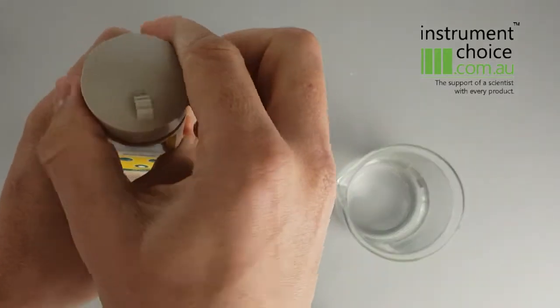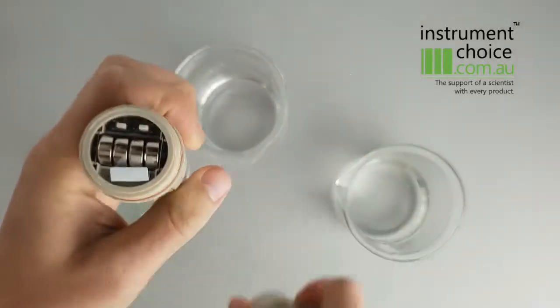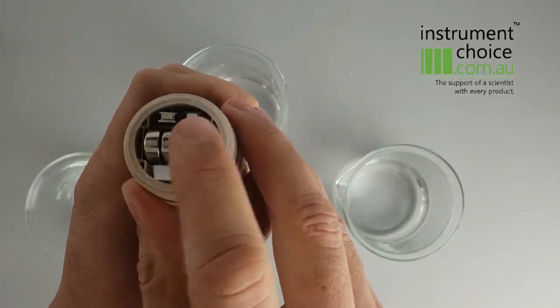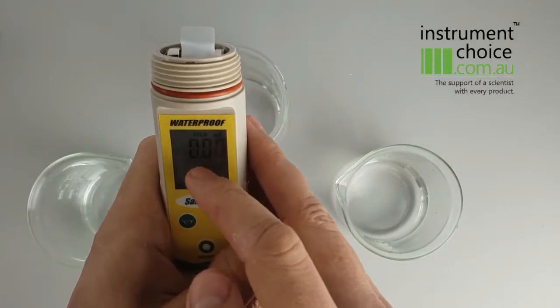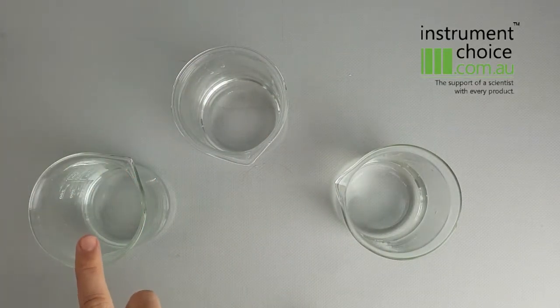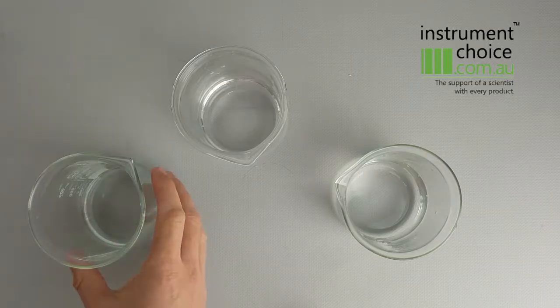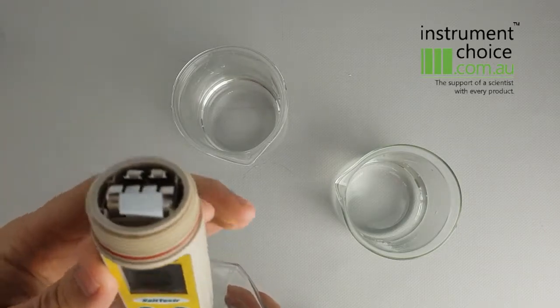You remove the top cap and underneath there's an increase and a decrease button, so either of these will adjust your value on the screen. I've got a 3,000 ppm or 3 ppt solution here, so what I want to do is adjust my meter to match that value.